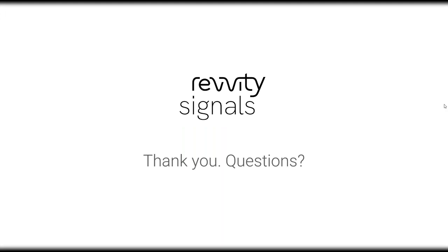For inventory, has the inventory been validated for use as a sample tracking system with an HTA license? I think that's more of a question for Anne. I don't know what an HTA license is. I apologize. Susan, why don't you follow up with what an HTA license is, and we can double check that. If not, we'll follow up with an email just to confirm.